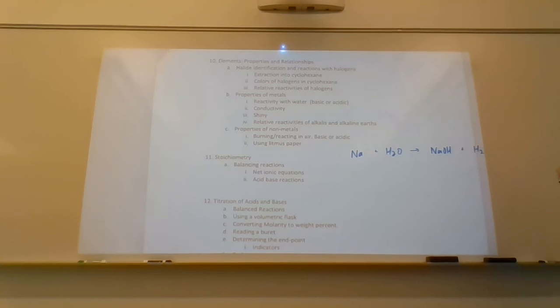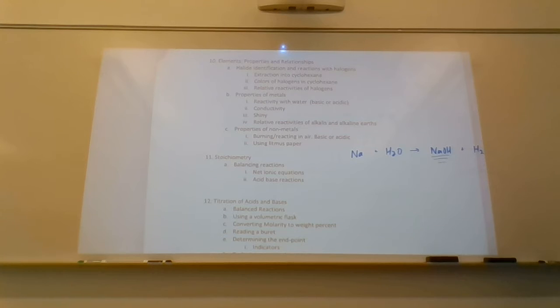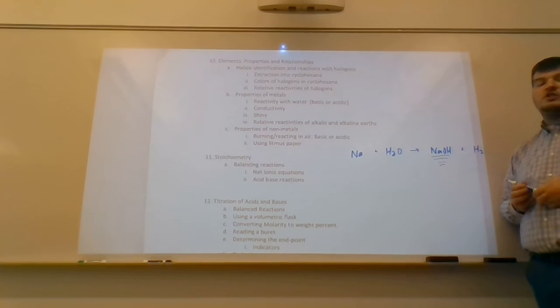I don't care, I'm not going to balance it. Based upon this information, then, what would we expect this solution to be? Acidic, basic, or neutral? Basic. This is going to make a basic solution. Now, how can we test this? We should take some litmus paper. So if I were to take a blue litmus paper and put some of this solution on the blue litmus paper, what would happen? It wouldn't change, no change.